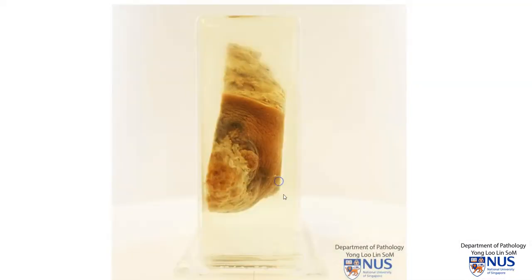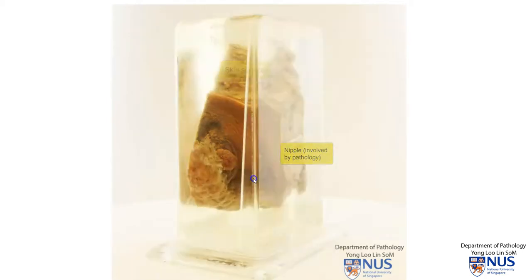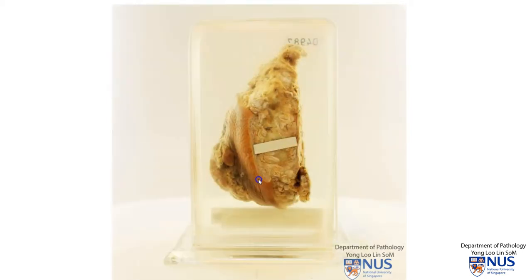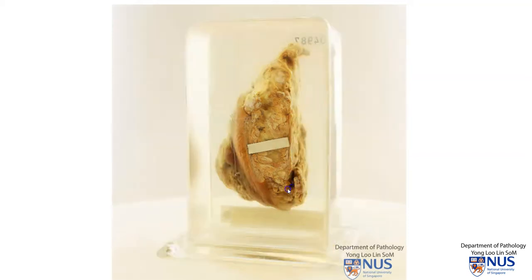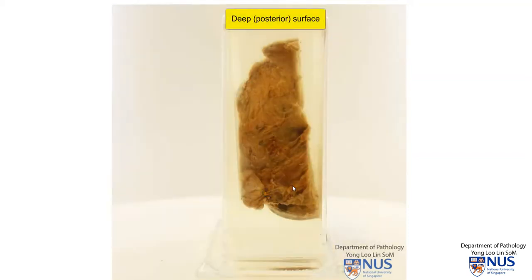Let's turn the specimen and here we can see the skin surface. There is a very abnormal area here. This is the region of the nipple. On this opposite surface, this again is the edge of the skin and here is the underlying breast parenchyma. And this is the deep surface here.